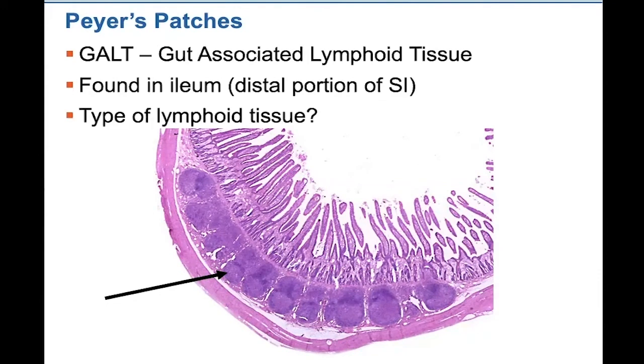Looking at this illustration, hopefully you can see here a follicle. So this is the epithelium right in here, the lamina propria here. It looks like this has gone into the submucosa. And then this is that muscularis externa, that outer layer of smooth muscles.